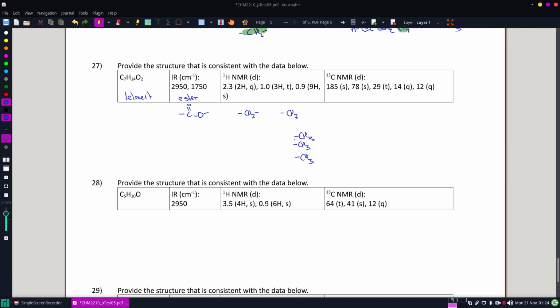They gotta be coming off the same thing. 1, 2, 3, 4, 5, 6 carbons. I'm missing a 7th carbon. Clever. Alright. What I'm going to do with that missing carbon is have these guys come off of it. Yep, there's the singlet that corresponds with a totally all by itself carbon. Carbon with no hydrogens attached to it.